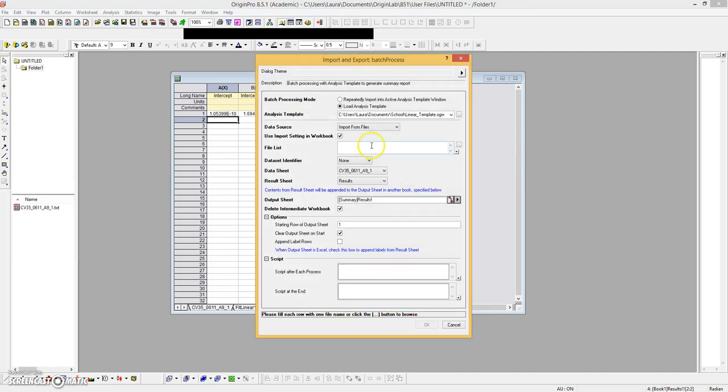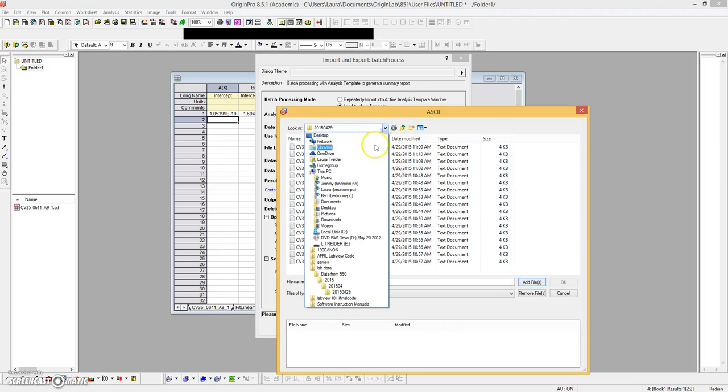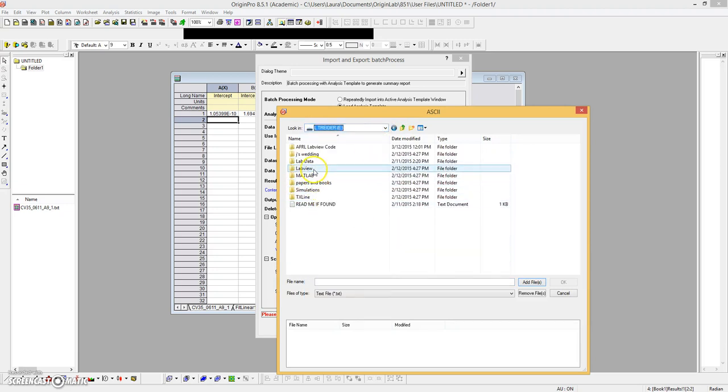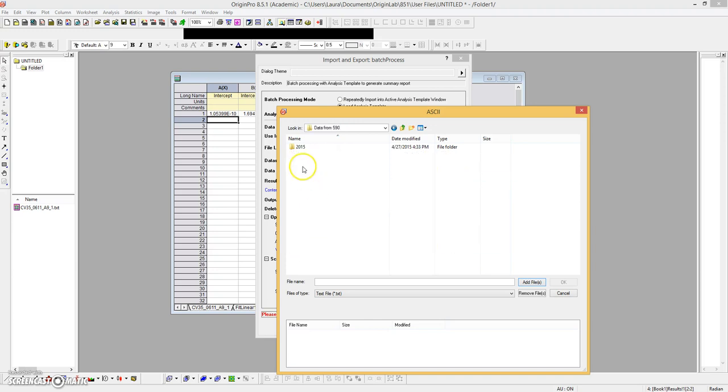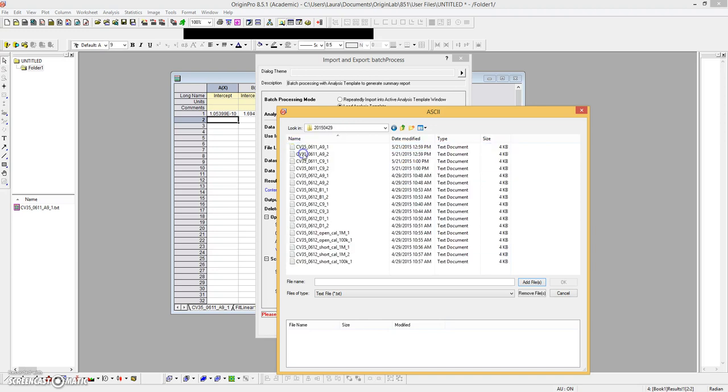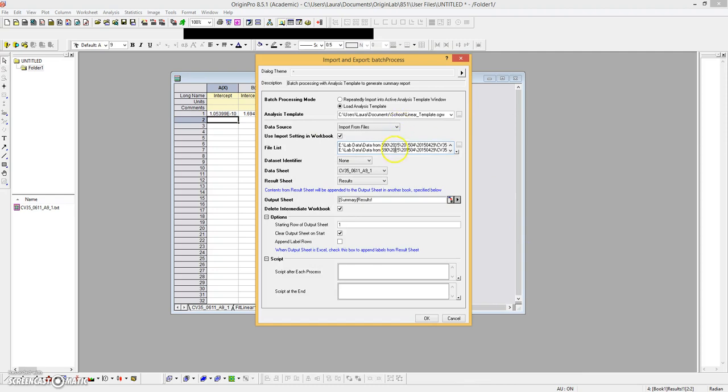File, batch processing. So we're going to use that template that I just built, and we're going to import some files. Okay, so let's do these four. It takes a little while. All right, this delete intermediate workbook—you can check it or not, it's really a matter of what you want. If you check it, these template workbooks will not print out for each data file and you're just going to get a results window.